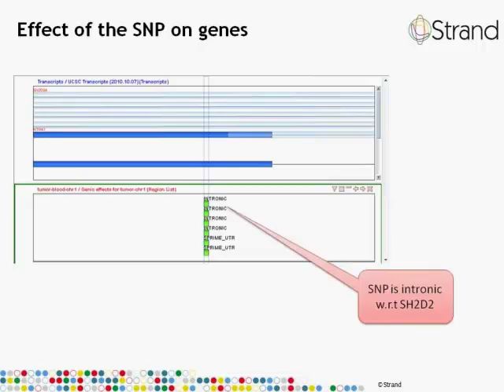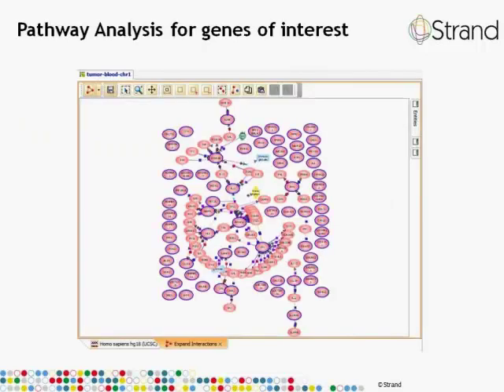Analyzing sequence data in cancer biology cannot be fully appreciated until one reaches the final steps of the analysis. We can appreciate that there are SNPs in the tumors and they lie in several genes and affect the protein structure. We can appreciate that there are genes with different read counts for their corresponding RNA, and hence these may give rise to different amounts of proteins, some of which may be very important. But how does all the biology of these affected proteins tie up into something meaningful? Avadis NGS provides you with a powerful pathway and GO analysis feature to appreciate the real biology in your data.